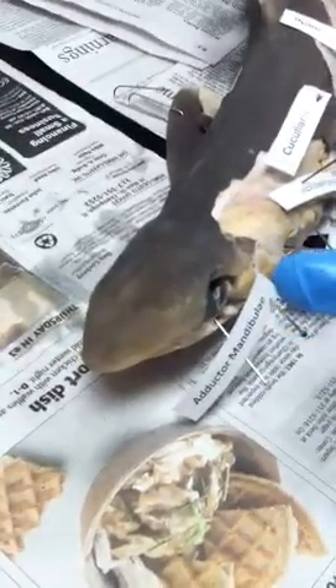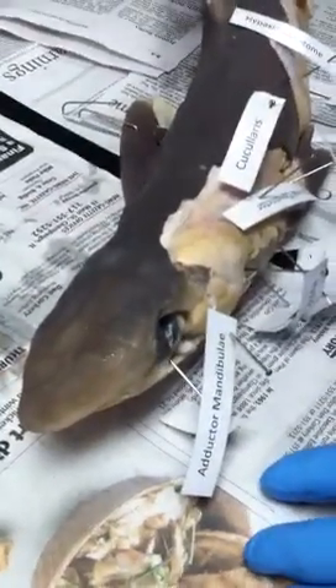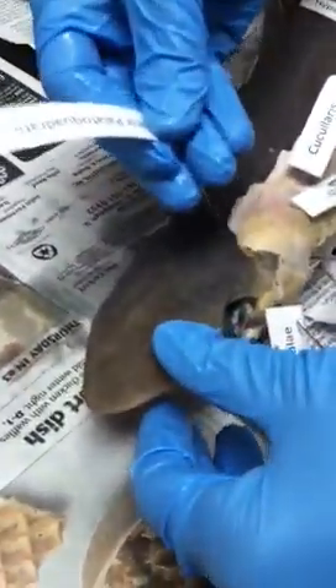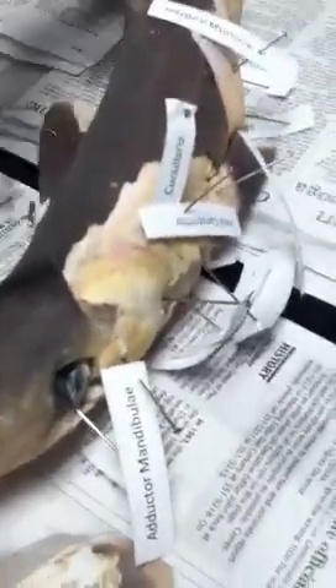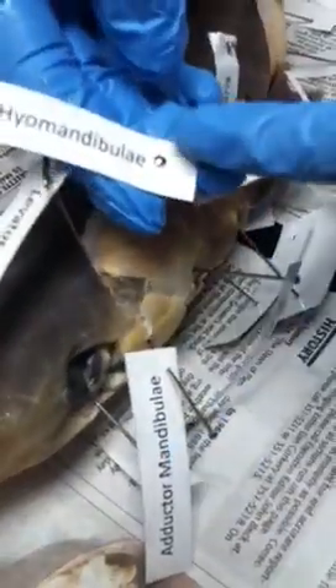Now I'm going to go to the spiracle region. I have two muscles — they're both levators and they're going to help raise the jaw. The one in front of the spiracle is going to be the levator palatoquadrate — I put it right in front of the spiracle. And now the second levator is right behind it — this pretty muscle right here is the levator hyomandibuli. It's higher than the adductor mandibulae.